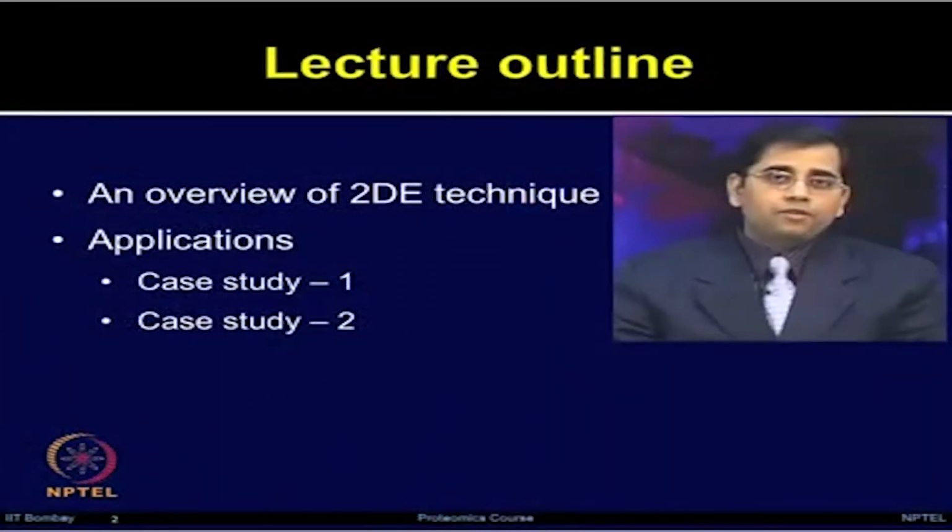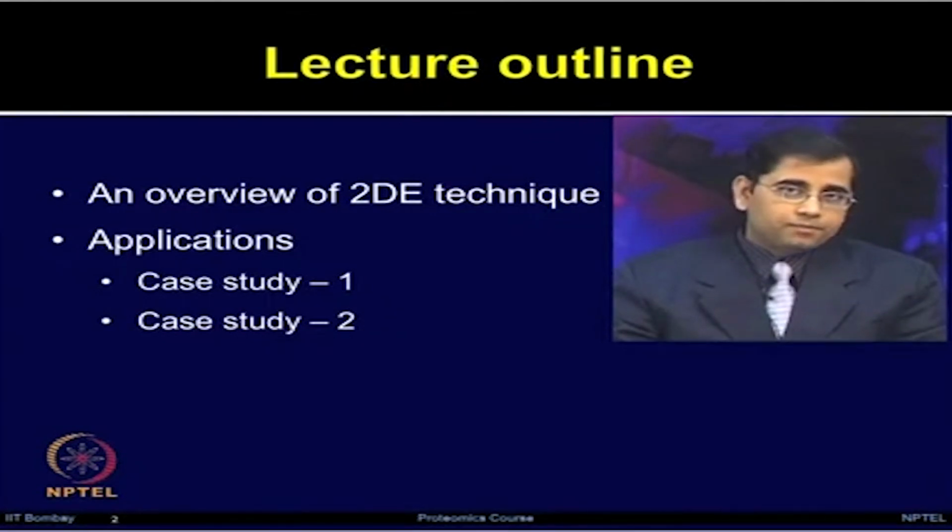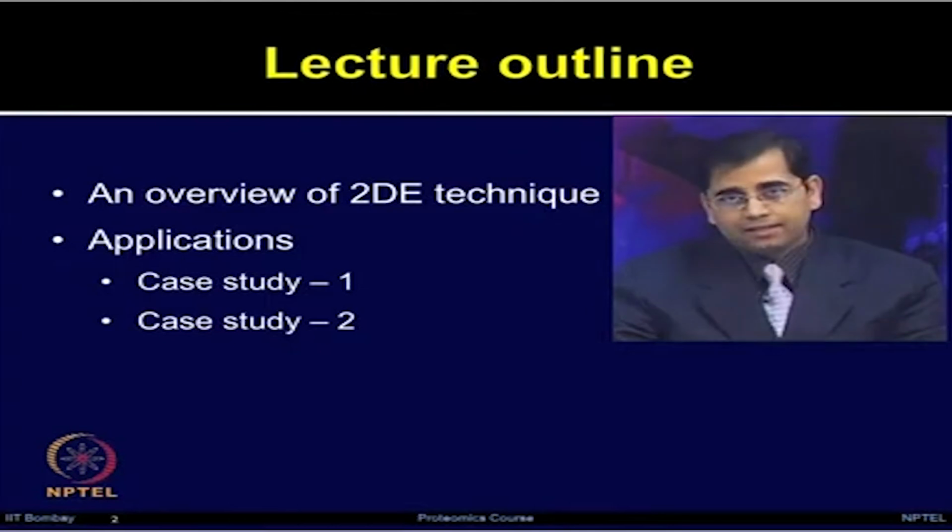So, today I will first give you an overview of the 2DE technique, just to refresh you about various things which we discussed in this module. And then I will give you a few example applications. We will take two case studies.